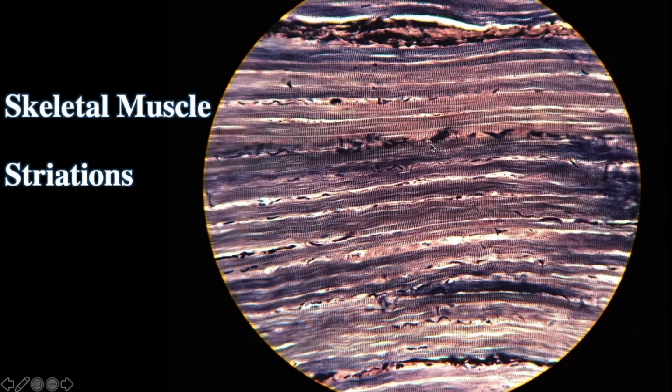Now, it is hard to find really good stains like this, so sometimes you'll need a clue. Sometimes skeletal muscle will look like cardiac or smooth muscle. But obviously, you got the striations going perpendicular. These little etch marks going perpendicular to the fiber, this could be a lab practical question: what are these marks going this way? And the answer is striations. Here's some more. You see them going like this.